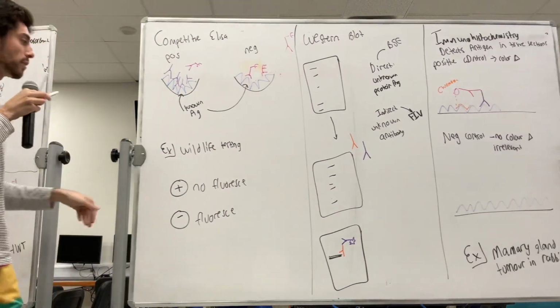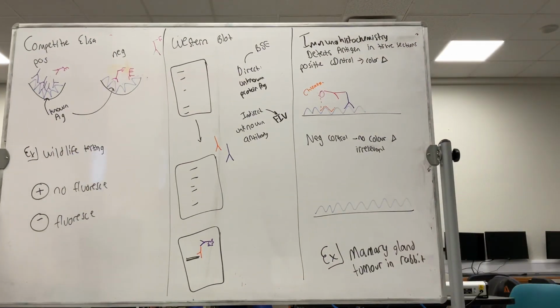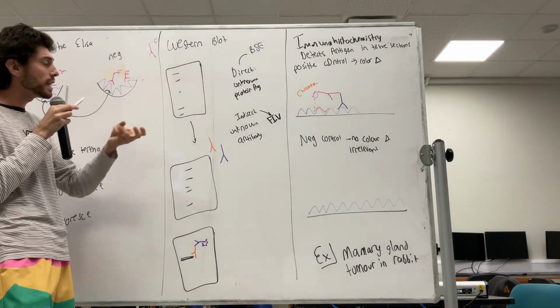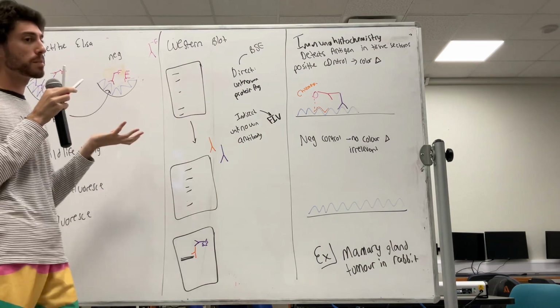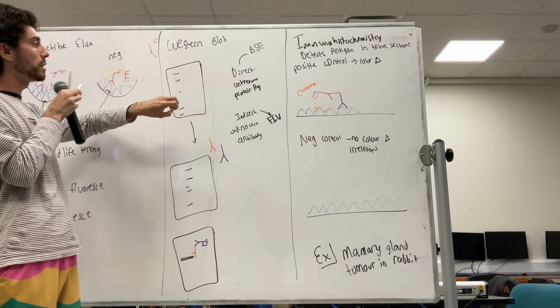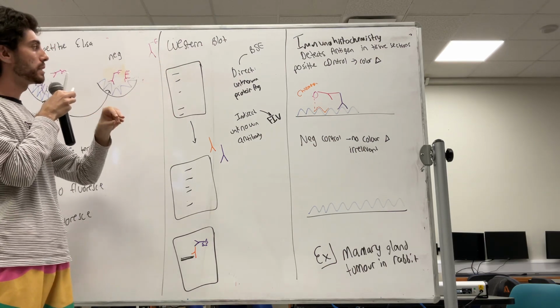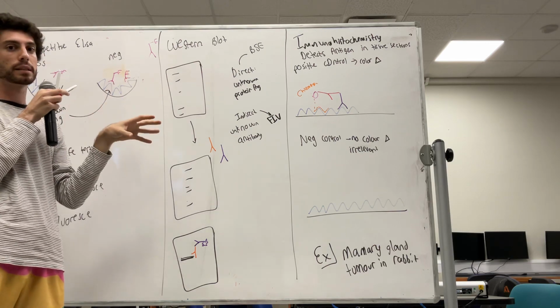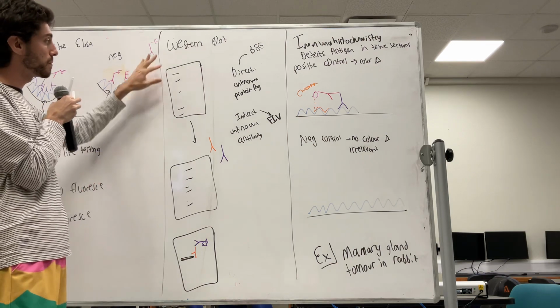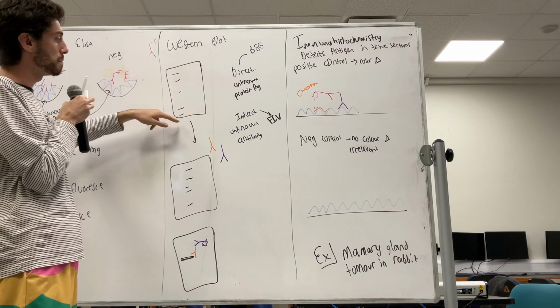All right, great. Let's go on to the last two. So now we have a Western blot test, which is pretty cool. Essentially, we have a gel electrophoresis, and we know that proteins are charged. We will insert proteins into a lane just here, and we put it in an electric plate basically, and the proteins will move depending on their charge. From there, the proteins will move along the lanes, and they'll become bands.